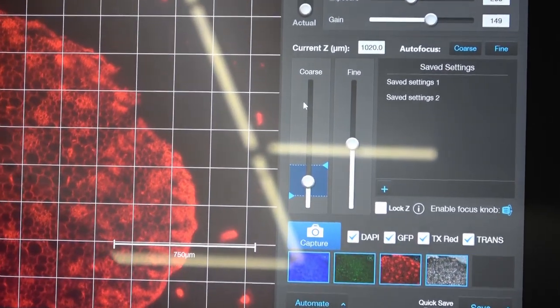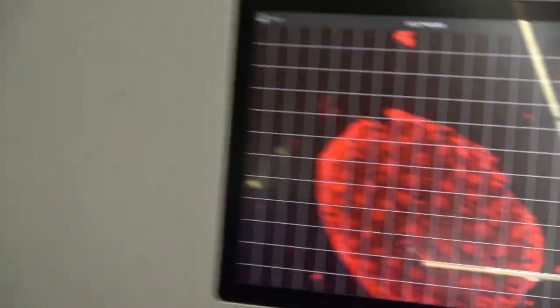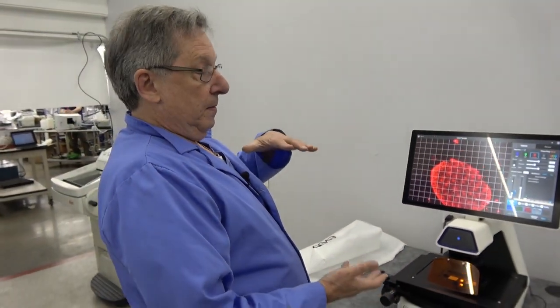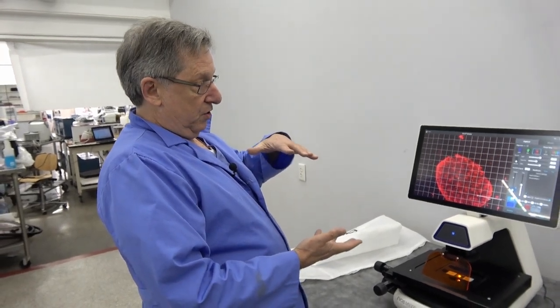This can be set for if you're going to be doing Z staging, which is to look at different levels in your target and your objective.